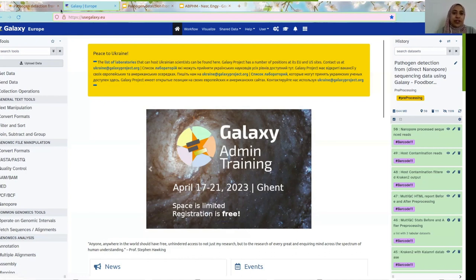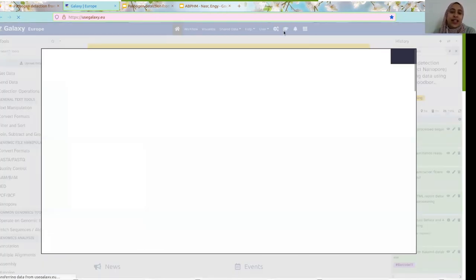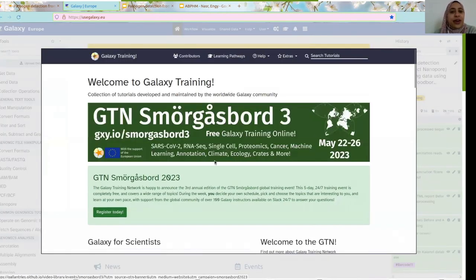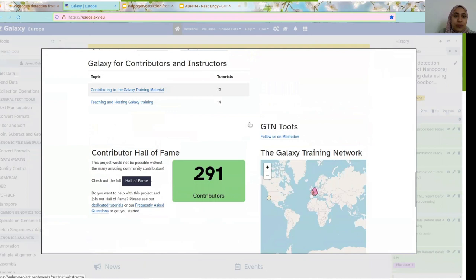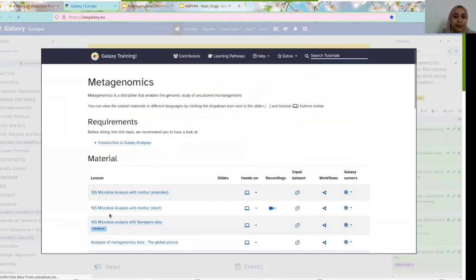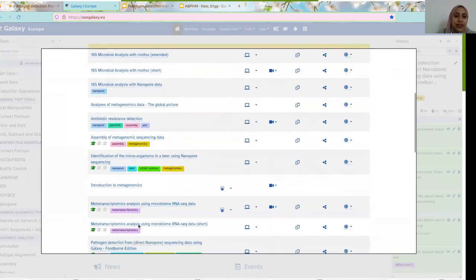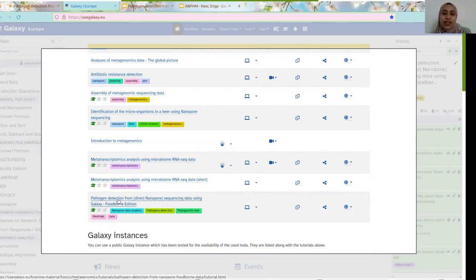So by starting our training — as you learned, in order to reach our training material, you can simply click here on this hat and you are opened into the Galaxy Training Network. Our training today is in the metagenomics part, so you scroll down to metagenomics. It's the last one: pathogen detection for direct nanopore sequencing data using Galaxy foodborne edition.